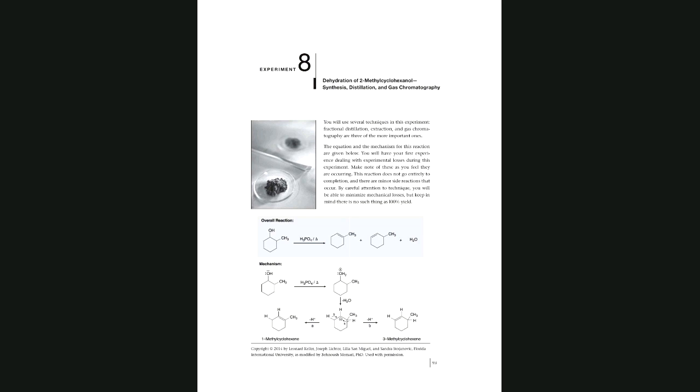Can we use recrystallization? Can we use extraction? Can we use something else in this reaction? Why is distillation a perfect choice or a good choice? That is one of the best choices here. Under what condition do you use distillation to purify a product?